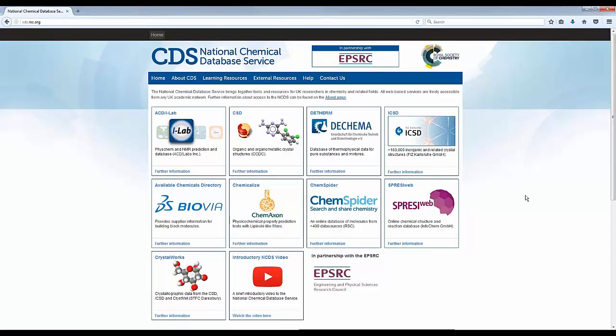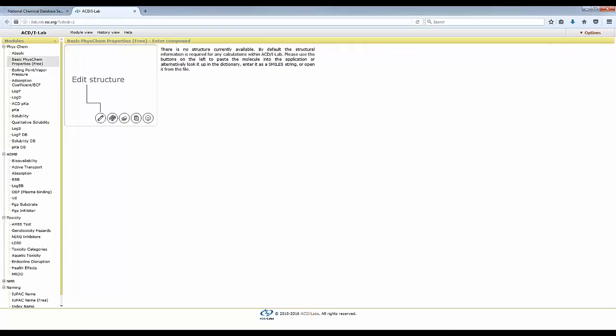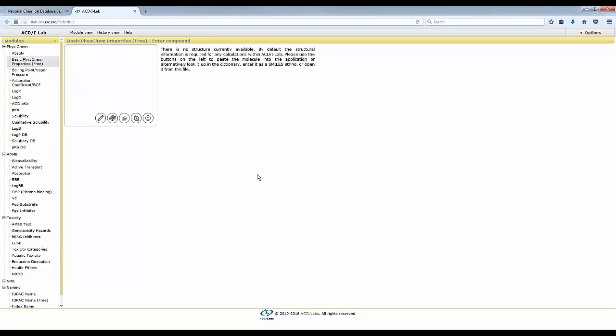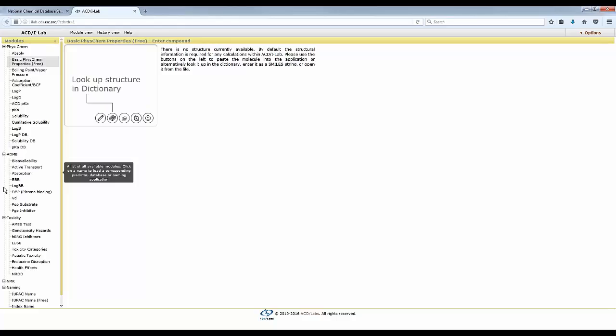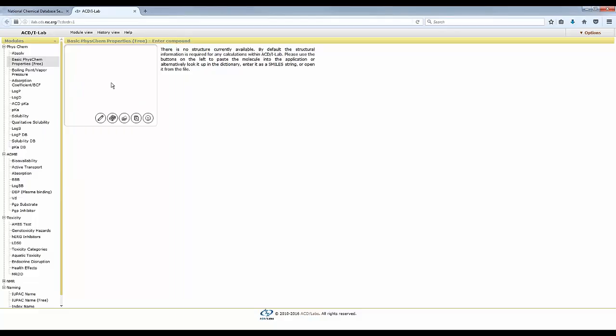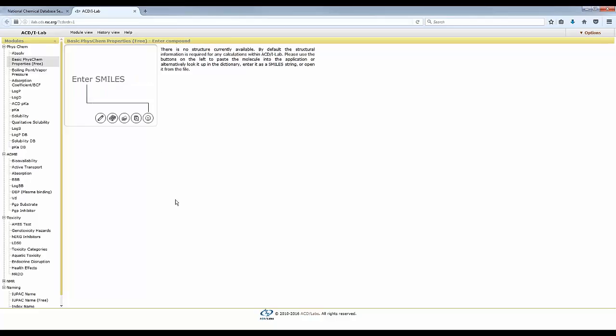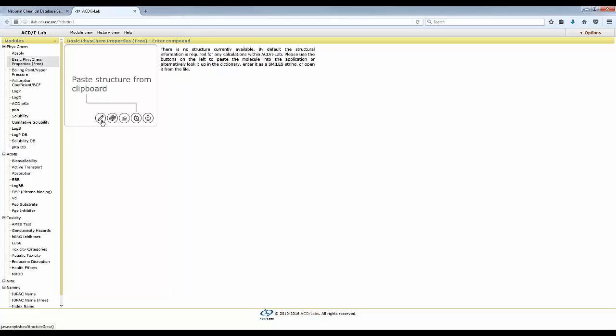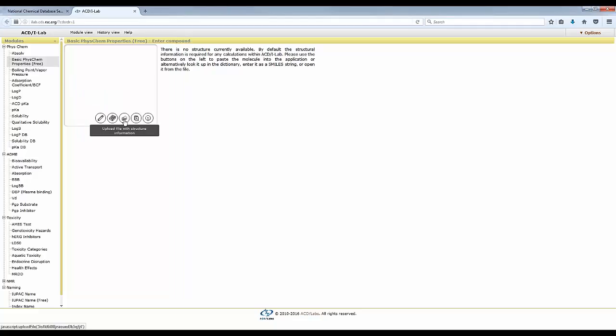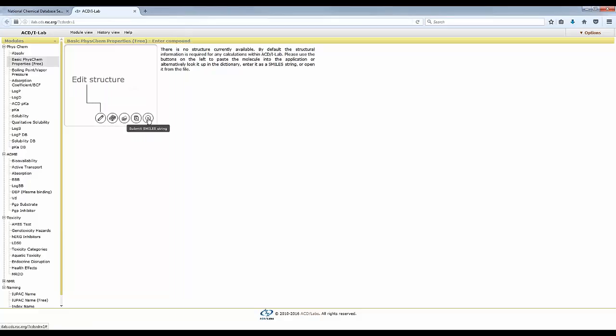Without further delays, let's move into the actual software. So I am here now at the CDS website, and I'm going to click the iLab. And I see it is connecting, and it directs me straight into the iLab. And I see here a few options that are opened and expanded, and I have here a window for the structure. So the first question is, how are we going to input a structure? And there are a few options. You can either draw it, or if you've drawn it, you can look at it in the dictionary. You can upload it from a file on your computer. You can paste it from the clipboard. Or you can enter it in SMILES notation.